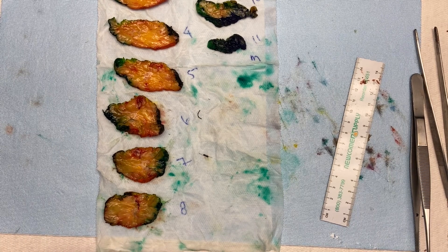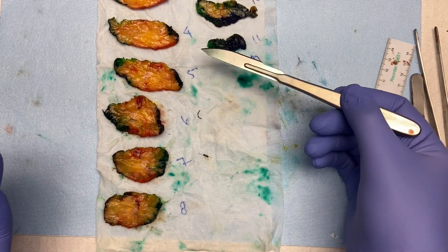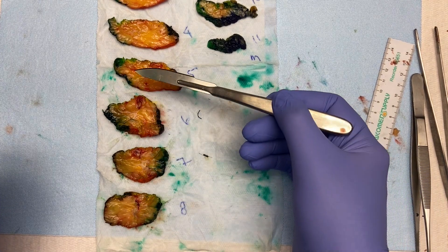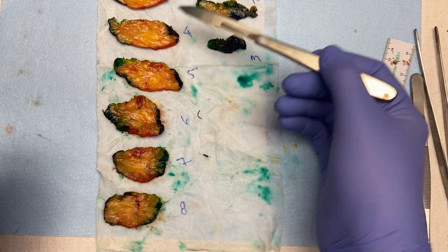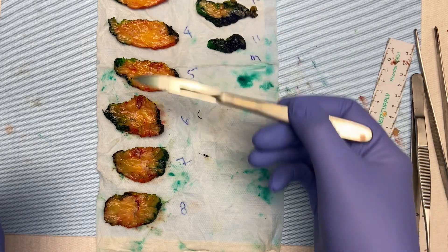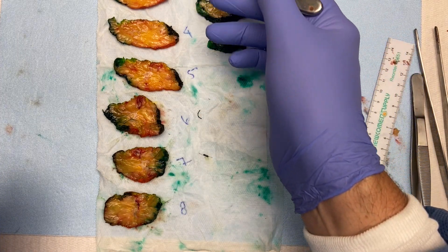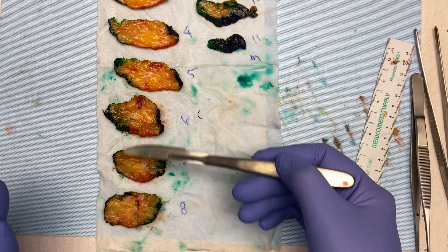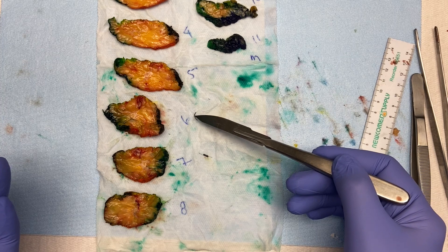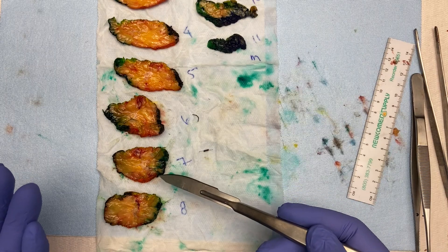There are two ways to approach submission. Some places want you to start with the tumor — in that case you'd start with slice five and march down to eight, then do the corresponding slices four and nine. Since I'm submitting the entire specimen, I'll just start on the lateral side and submit everything. They already know which slices have the tumor, which had the biopsy clip, and which had the Savi Scout, so I'm just marching all the way down.